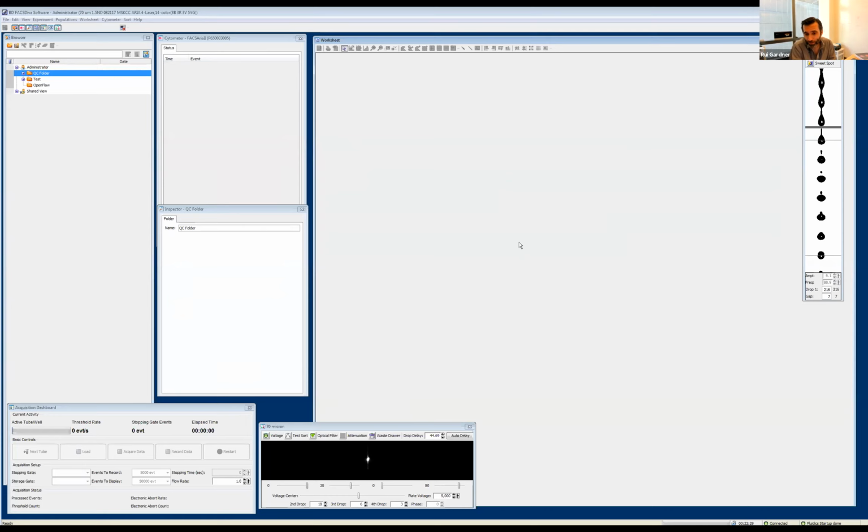Here's another interesting question. What do the gap and drop one numbers represent? Are they pixels? Yes, they are. They're just relative. The drop one is the distance between that thin line and the top of the camera, in pixels. So it's just the distance. Actually, if you move the camera, those values will move, but the drop break-off is actually in the same position. So that's something to look out for. Don't knock the camera while it's sorting.